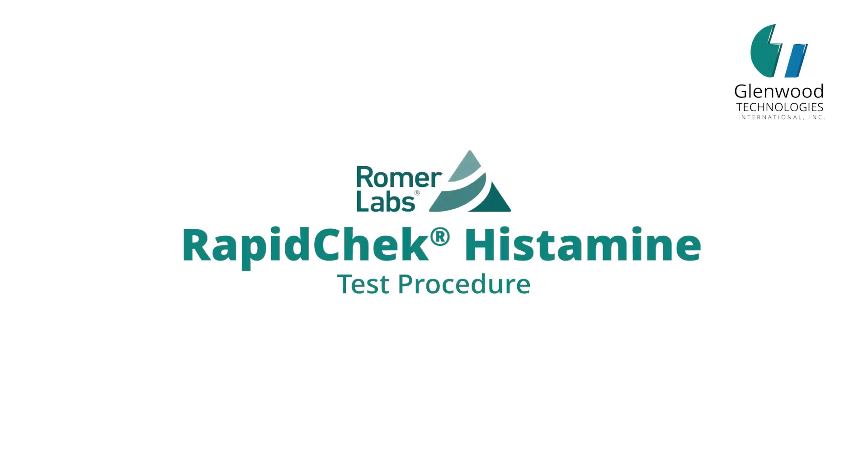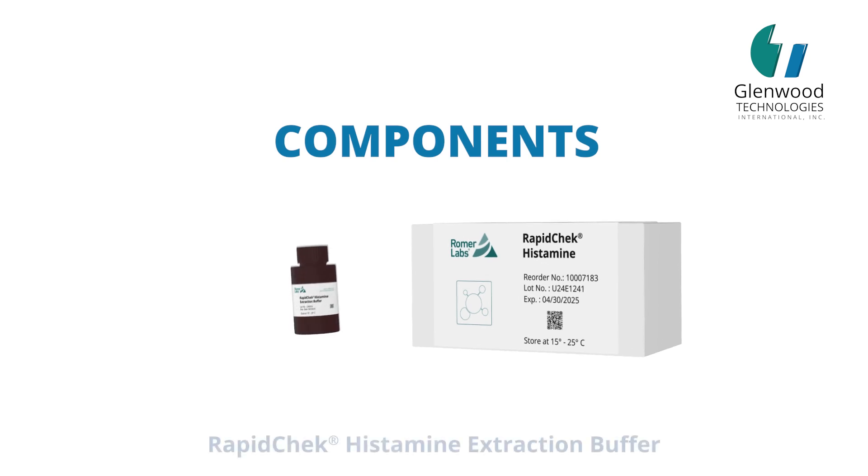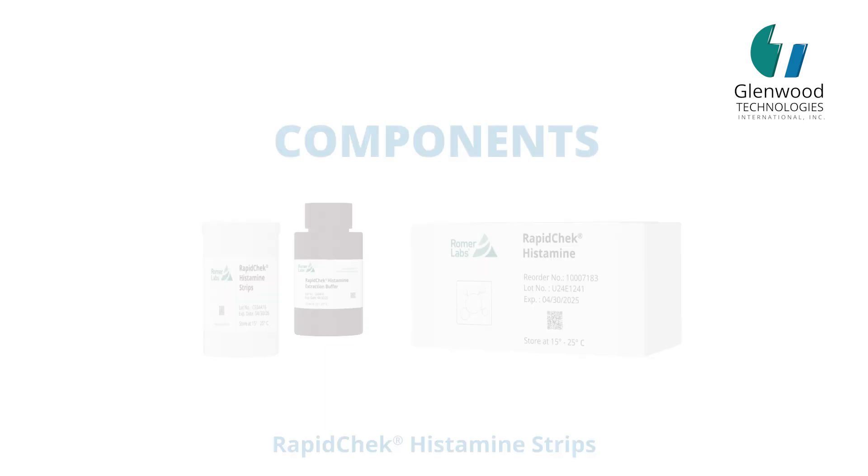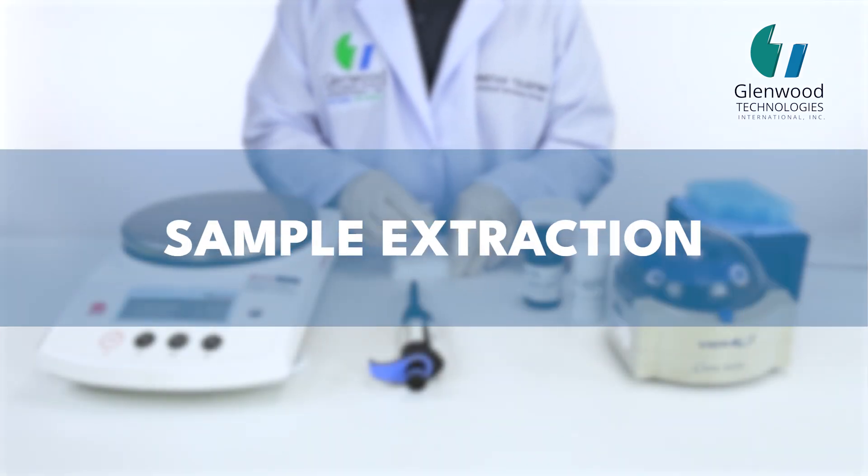Roma Labs Rapid Check Histamine Test Procedure. Components required: Rapid Check Histamine Extraction Buffer and Rapid Check Histamine Strips. Sample Extraction.